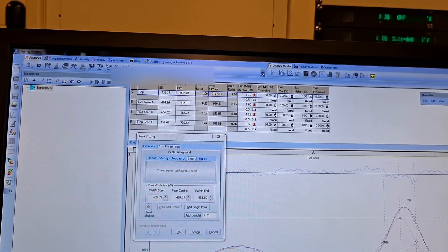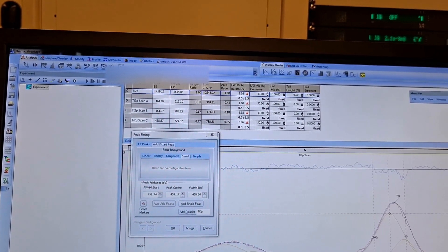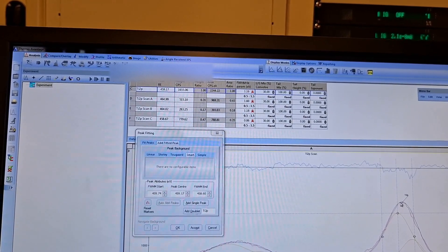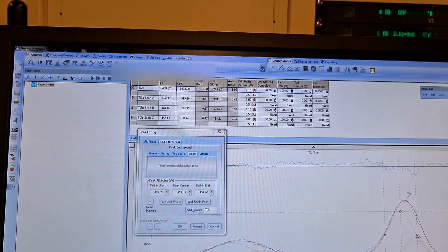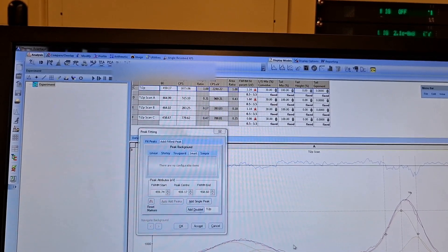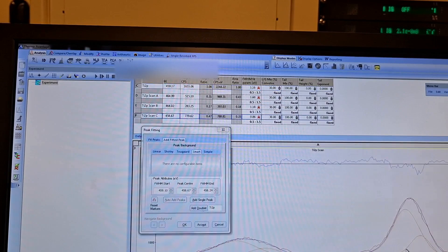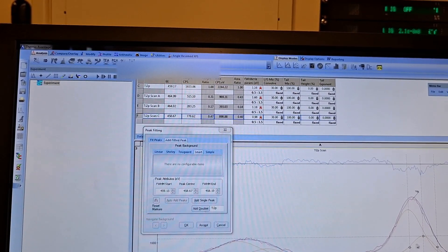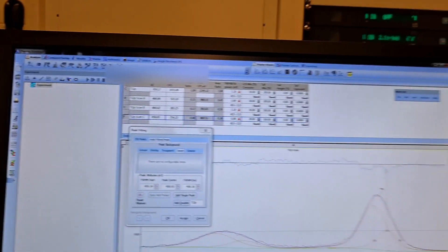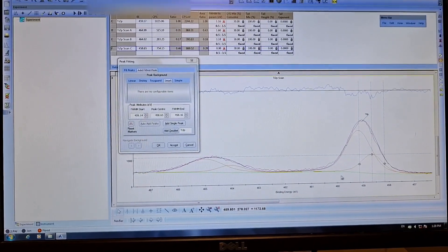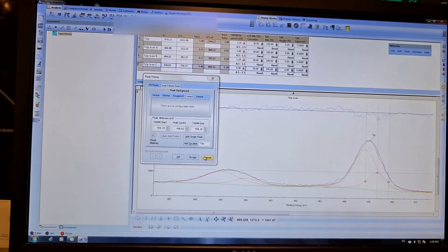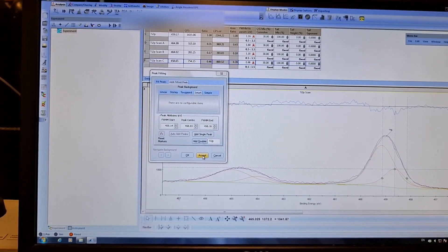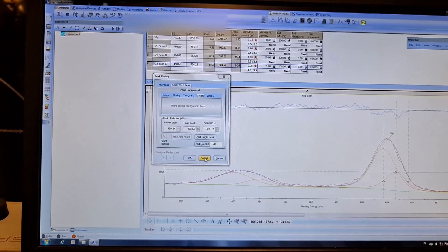I think for data interpretation it is good, but of course I cannot publish it. Not bad, not perfect, but this is the titanium 2p fitting. If I accept it, it should keep the peaks.